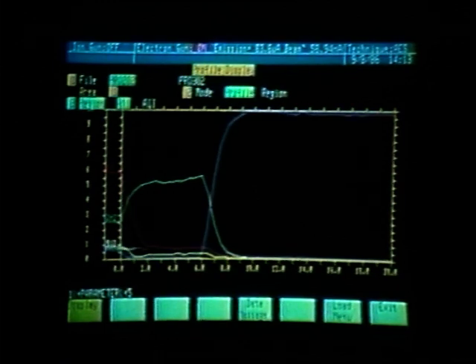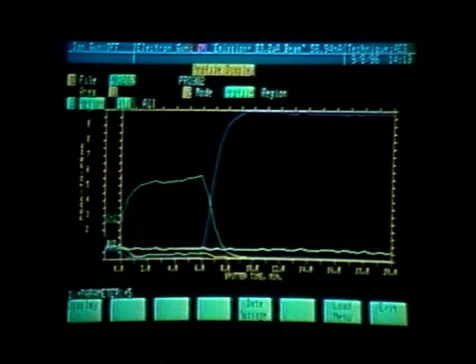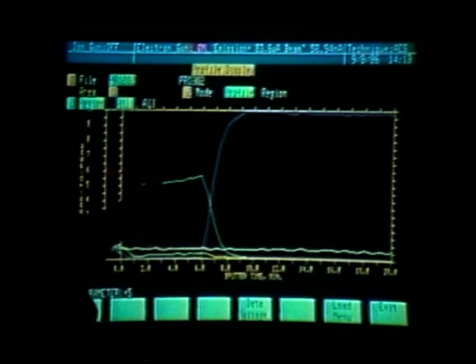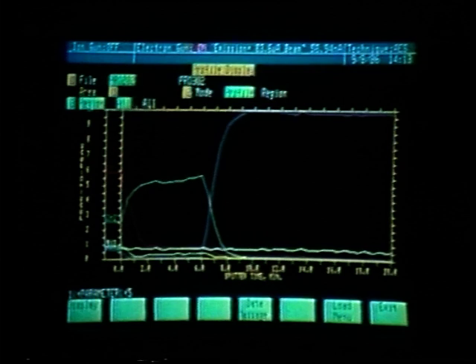We now see a dramatic difference in the oxygen peak. Before, we had oxygen displayed very high in the region where we have high chromium. Now that we have redefined that window, notice that oxygen is very low where we're seeing chromium. Again, now that we have redefined the window, that tells us that the oxygen peak that we were seeing originally was strongly influenced by the chromium peak, when indeed there was no oxygen present.